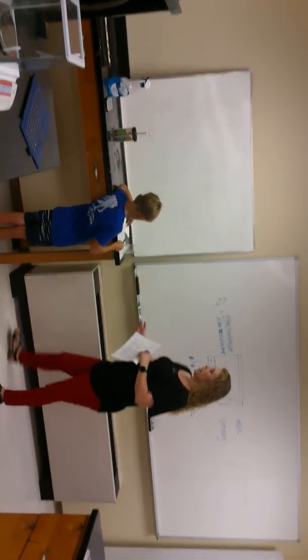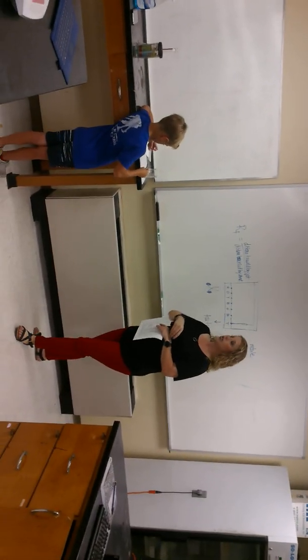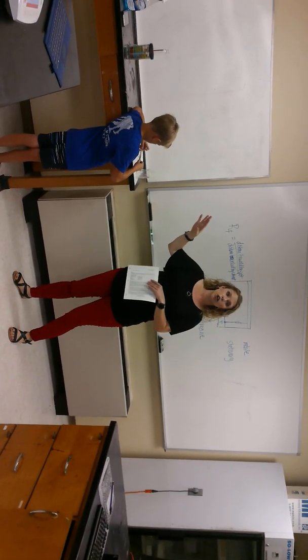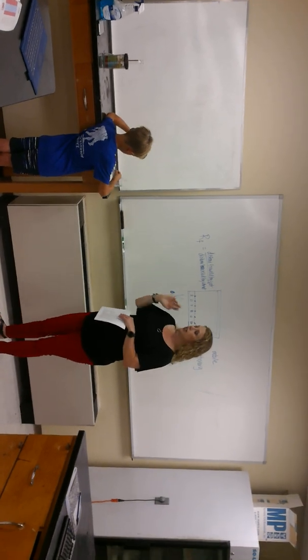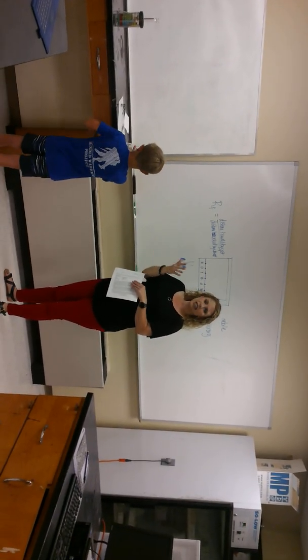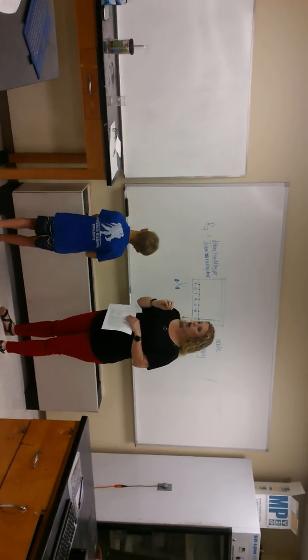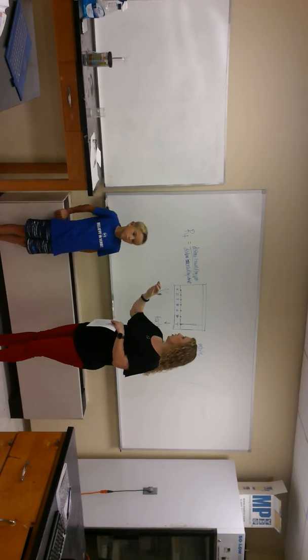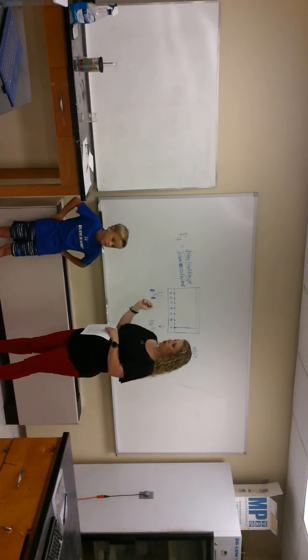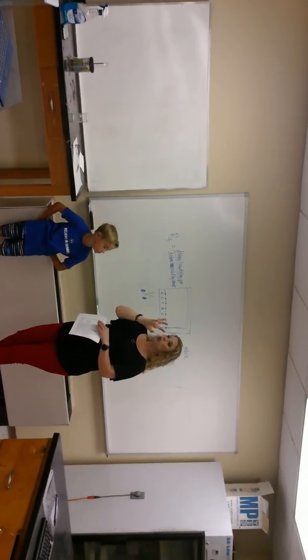Once we get our yarn ready, now we're ready to get our M&Ms. So we're going to take an M&M and we're going to put it down into our test tube. You can use those same test tubes because it's just had acetic acid in it, so it's the same thing. Now, once we get our M&Ms, you're going to have 6 test tubes, each with each color in them. Once we get them in there, we want to boil them only long enough to get the candy coating off. And you'll notice it coming off.